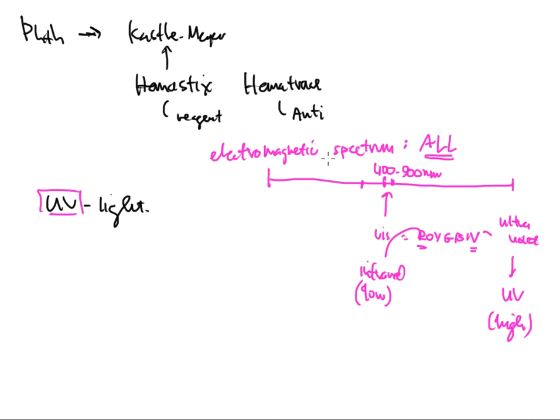The UV region typically goes from 200 to 400. So this is our area, or what we would call a nanometer area that we are after. Nanometer is going to be abbreviated with an NM, okay? So this UV light energy typically goes from 200 to 400 most of the time.